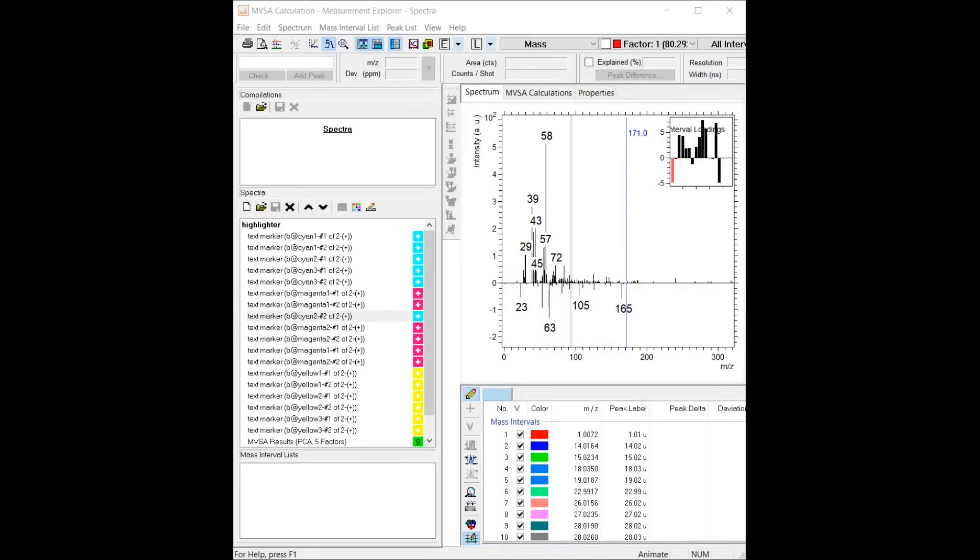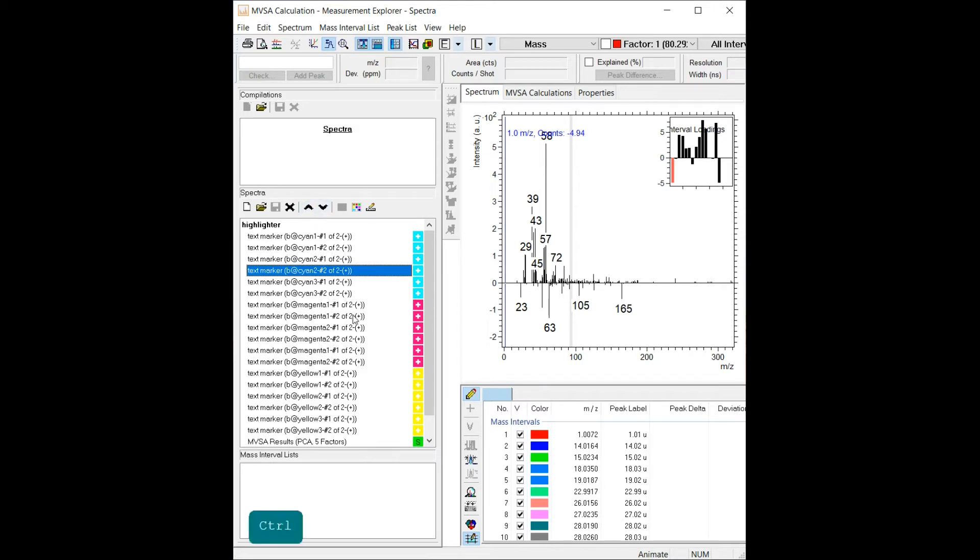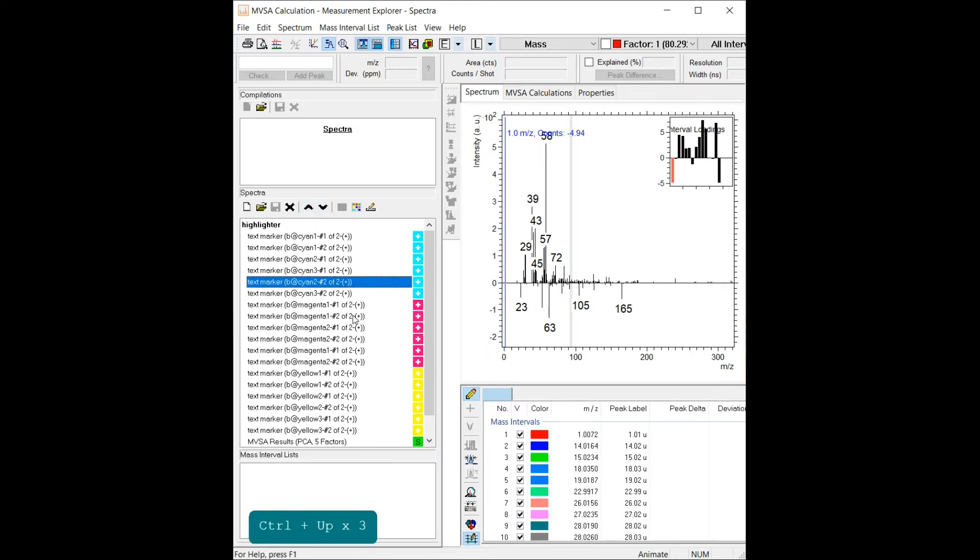It is now possible to rearrange the data views within an extended analysis either with the arrow buttons in the data list or using the shortcut CTRL and UP or DOWN on your keyboard.